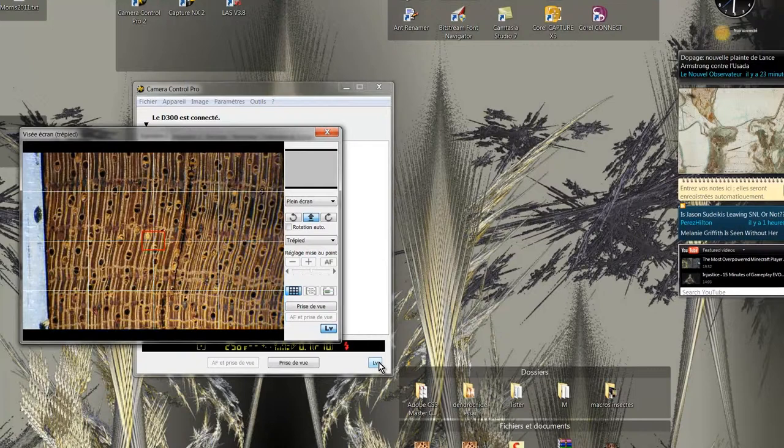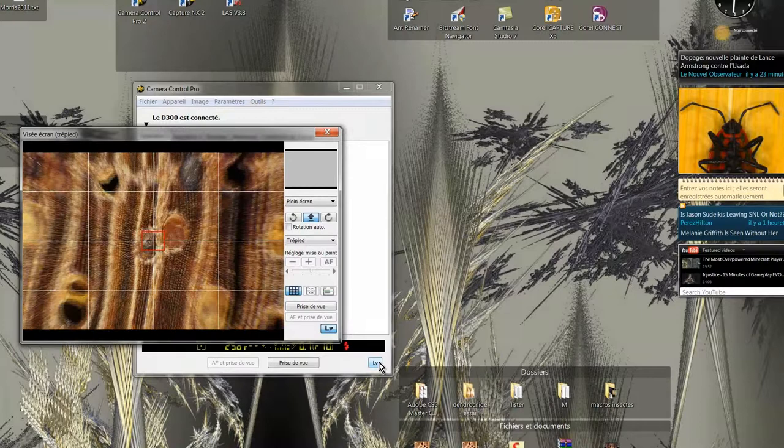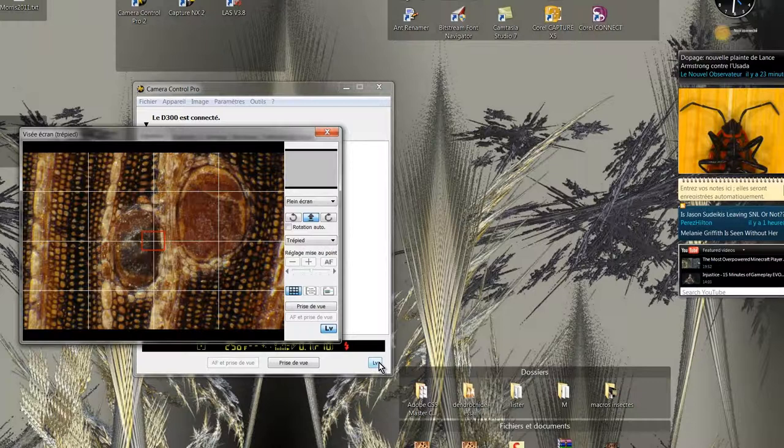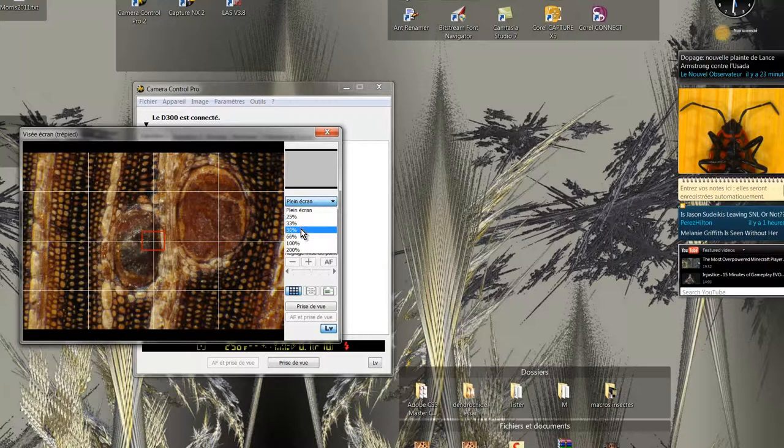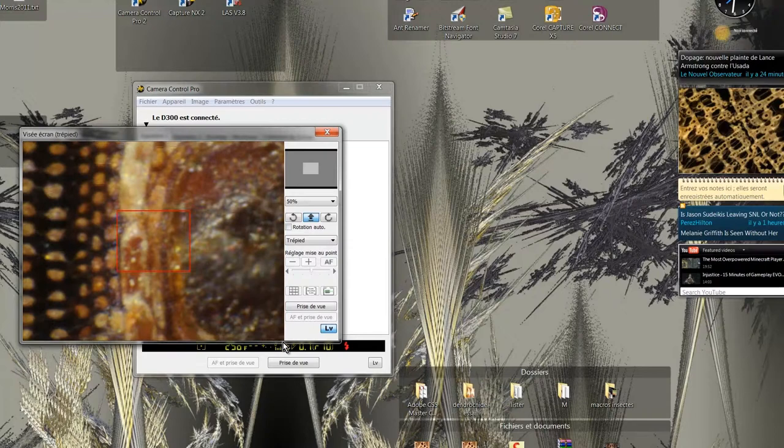Then I will zoom to the maximum to adjust the focus. At this point it is difficult to make a proper focus. So I move the sample to find a better place, such as here.